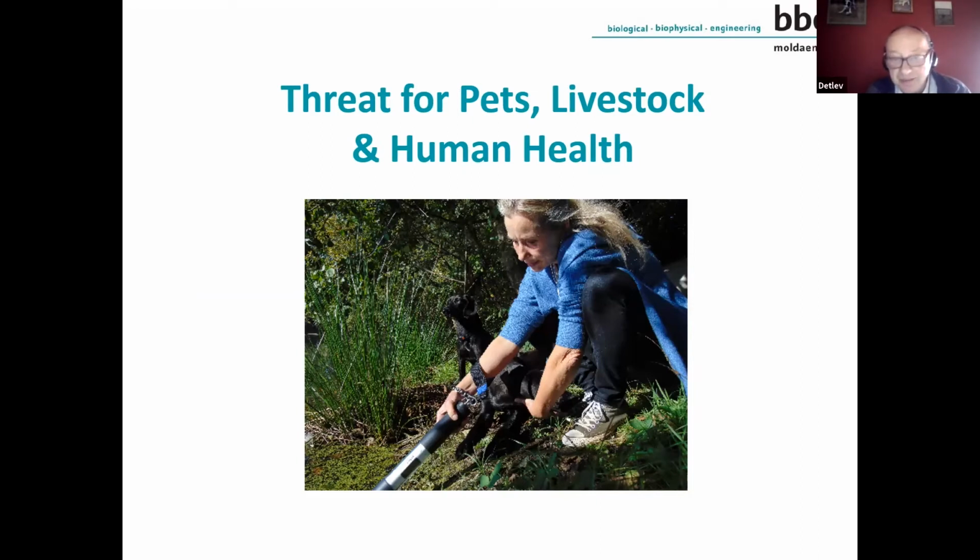You see here my colleague Annika from our sales office. She is measuring at the lake, and she is going out with her dogs all the time along the lakes here. Even in the shallow water, you can find sometimes a big growth of blue-green algae, which can harm pets within, let's say, a few minutes. If they bathe, for example, they swallow some water, and this can intoxicate the dogs, and they can die.